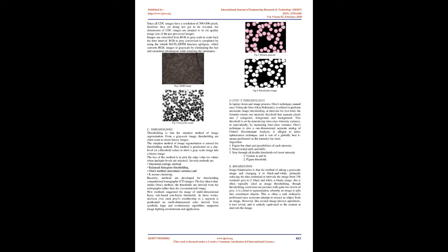Several methods are: maximum entropy method, balanced histogram thresholding, Otsu's method, maximum variance, and k-means clustering. Recently, methods have been developed for thresholding computerized tomography (CT) images.